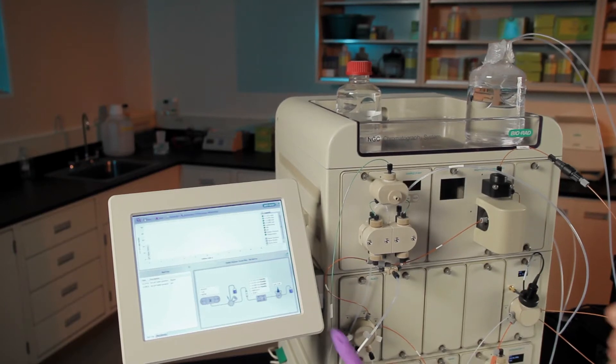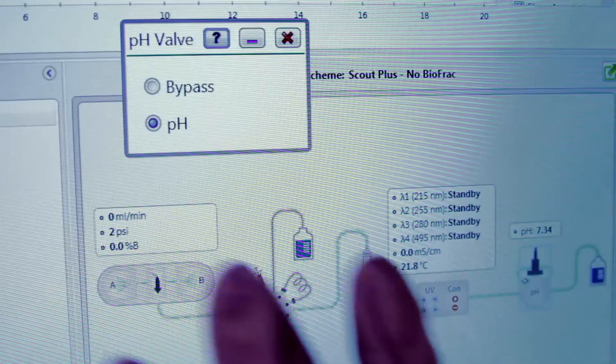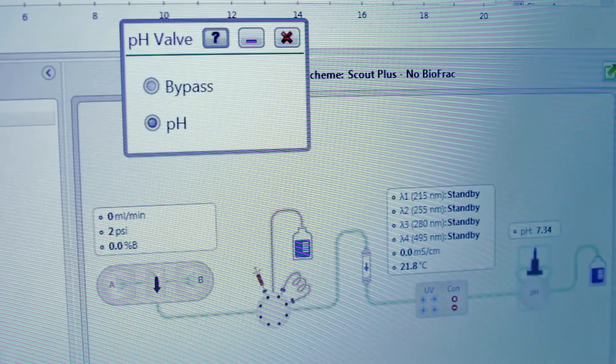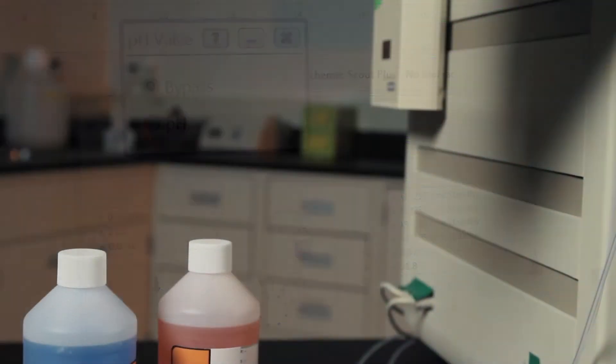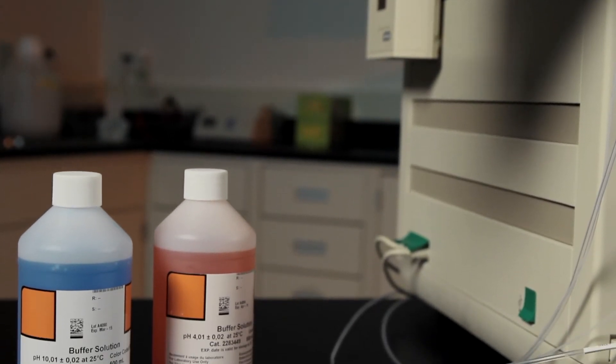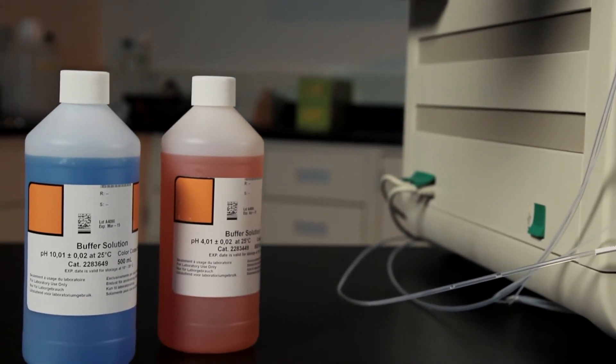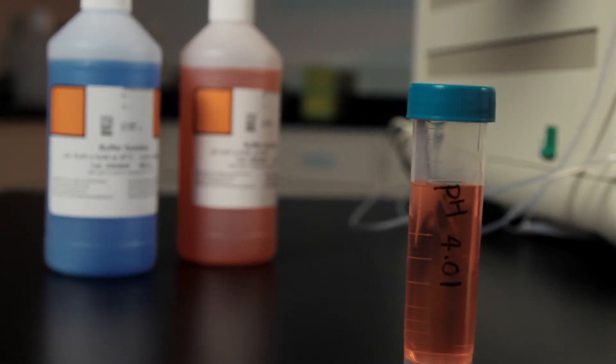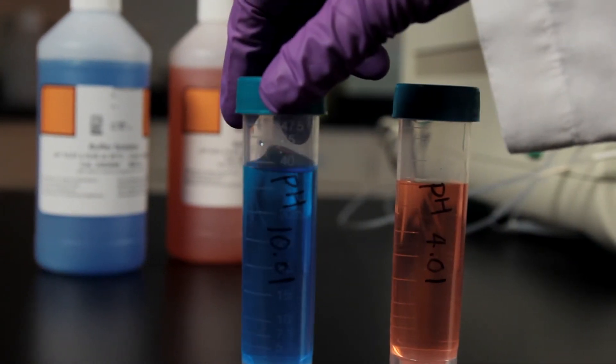If you are using the NGC's touch screen, you can touch the pH monitor icon in the fluidic scheme and select Bypass. To calibrate the pH valve, use two pH calibration buffers with a difference of at least one pH unit. Allow buffers to reach operating temperature before use.